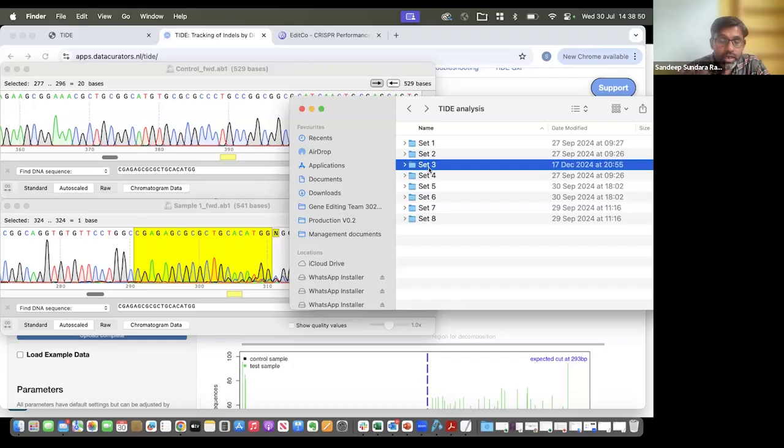You're welcome to have a look at it for about, I would give around 4 to 5 minutes, and I'm happy to take any questions. If you feel stuck, please let me know and I will run it through TIDE online. I'll keep the Zoom share on.